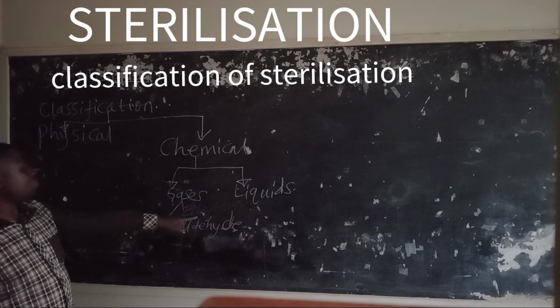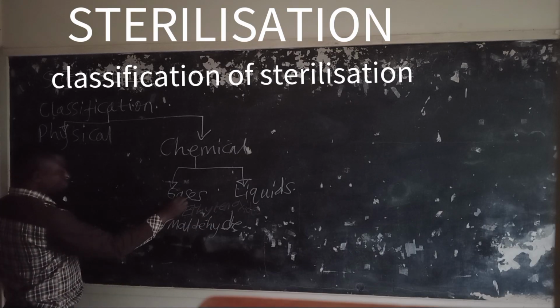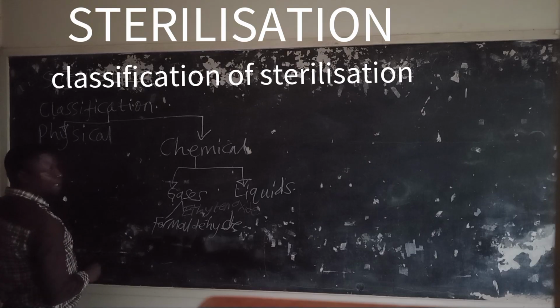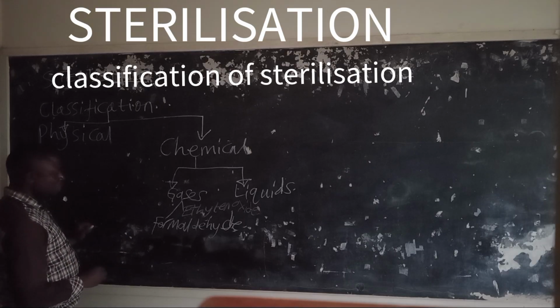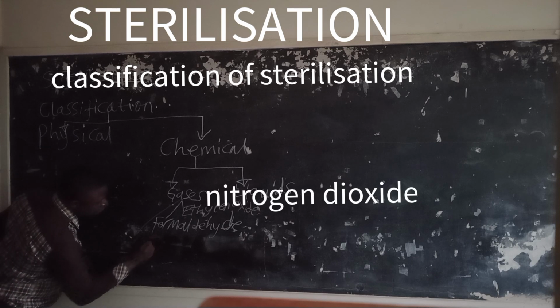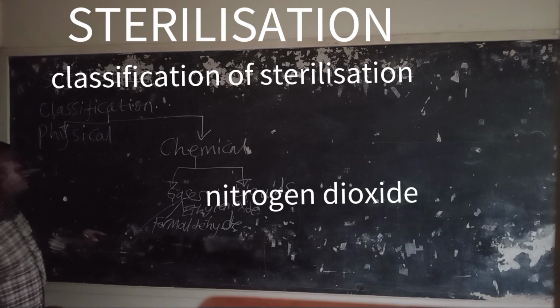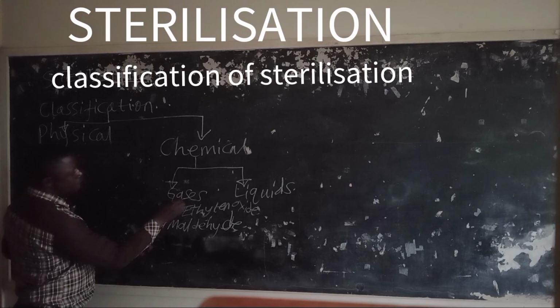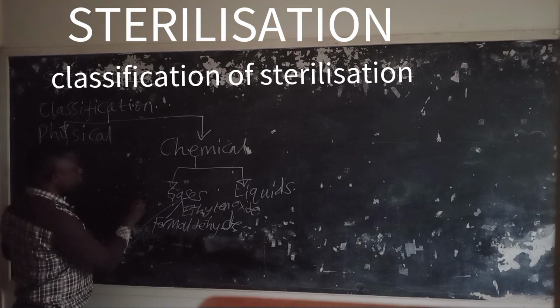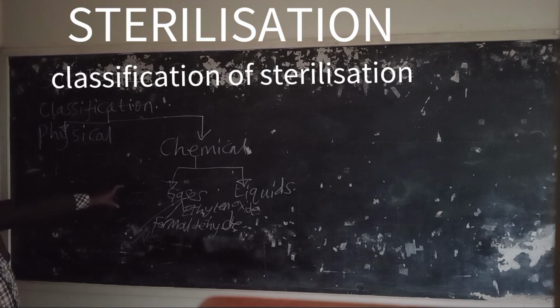We have also another gas which we call nitrogen dioxide. And also we have ozone. These are gases which we use for sterilization.